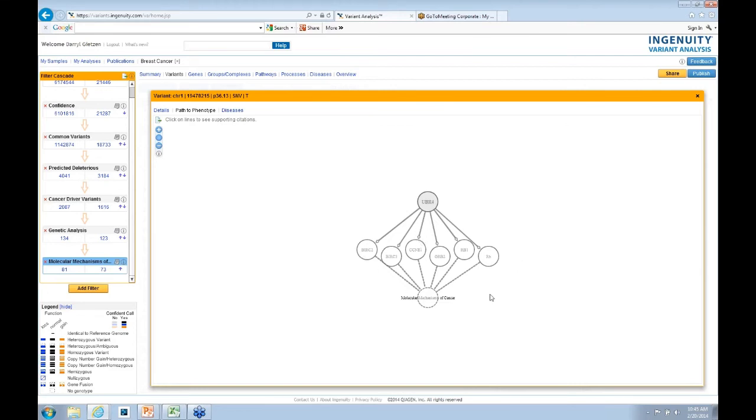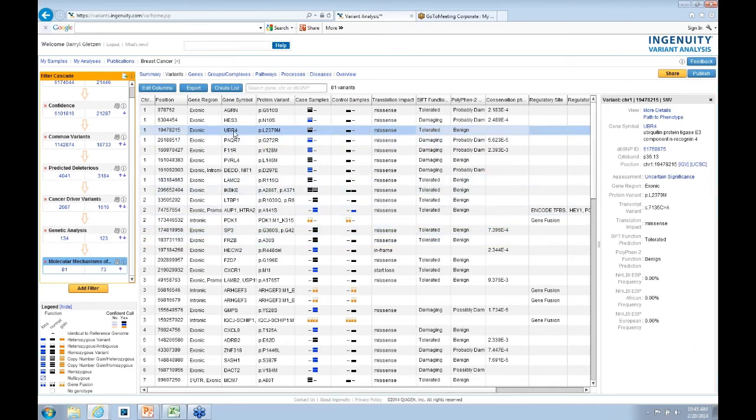So I'm going one hop up from my pathway now. These are my pathway genes. Here's a regulator of those pathway genes. But if I click on these lines, it's binding. Sorry, BRC2 is here, UBR4. It's a binding relationship. Each one of these is a binding relationship. They're okay, but they're not as strong, just from a biological context, as if they were biologically relevant.